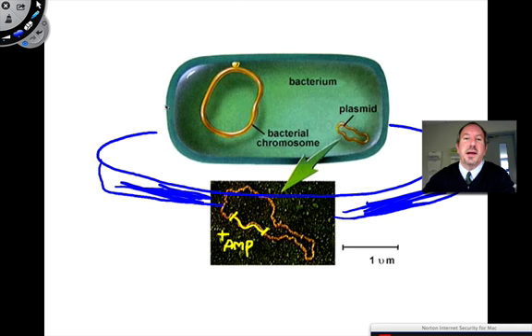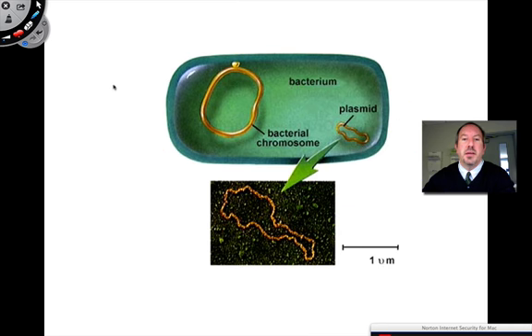If I have this bacteria and I sprinkle in some antibiotic, I'm going to kill this bacteria and it's not going to be able to grow, because I'm going to put ampicillin on here and it's going to kill the bacteria. They're not going to be able to grow. This bacteria will grow because it has a gene that is resistant to ampicillin. Okay? Just wanted to point that out.